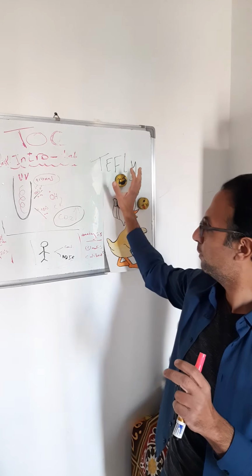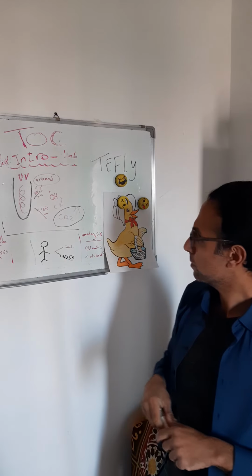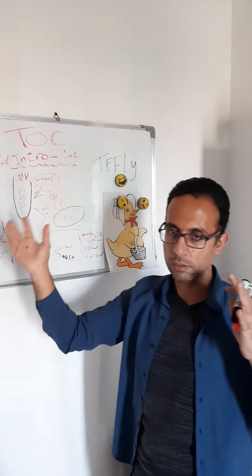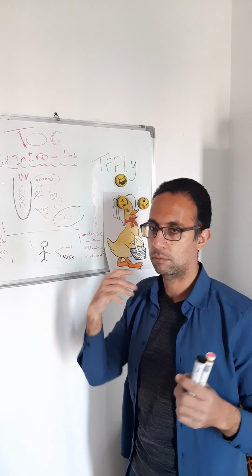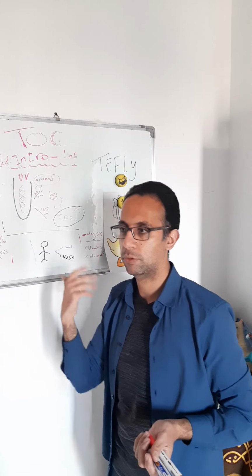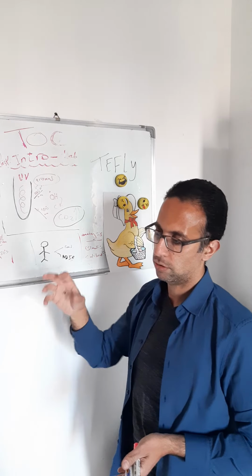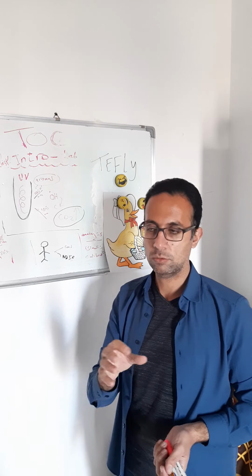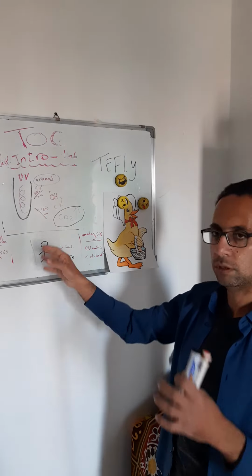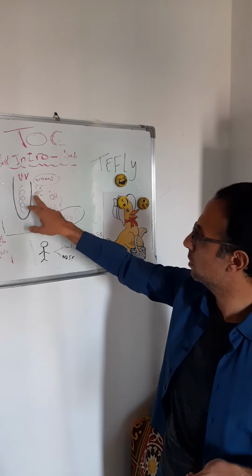I think till now we are TEFLY, trying to use illustrations. UV. These numbers are not accurate, and I'm doing this video based on hands-on experience and previous information, not accurate information from references right now. Of course I read before, but not right now. So the numbers may be okay, not accurate, but in this range.